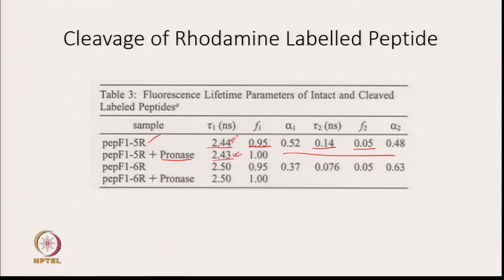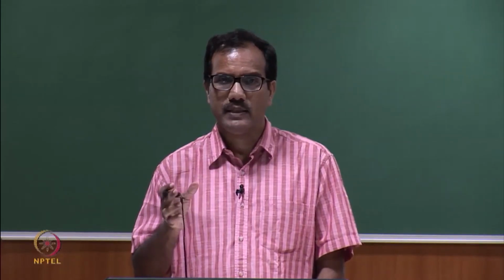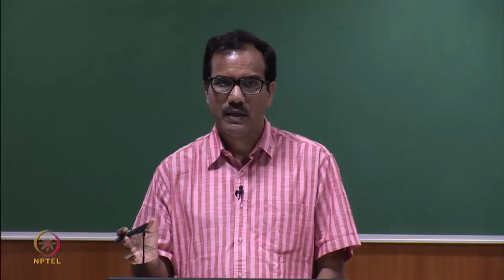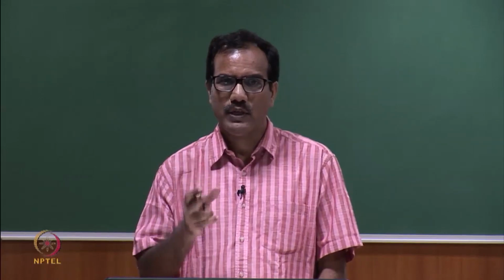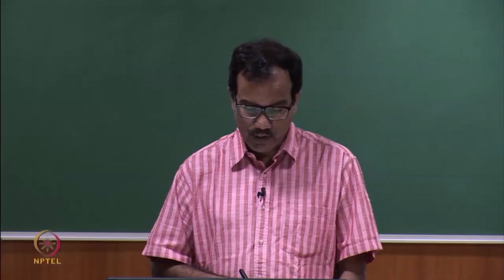And so, what kind of information we got? That the uncleaved peptide is an equilibrium between two conformations, but when I cut through pronase, it gives you only one conformation with the lifetime 2.43.